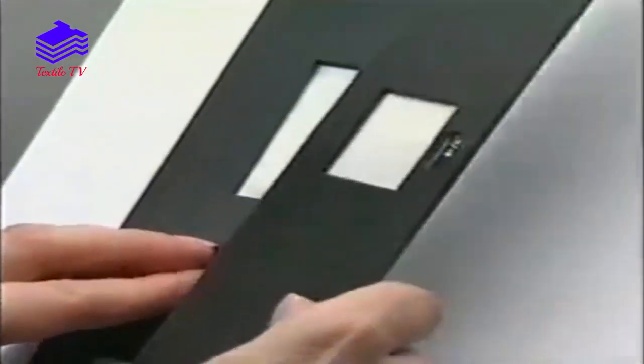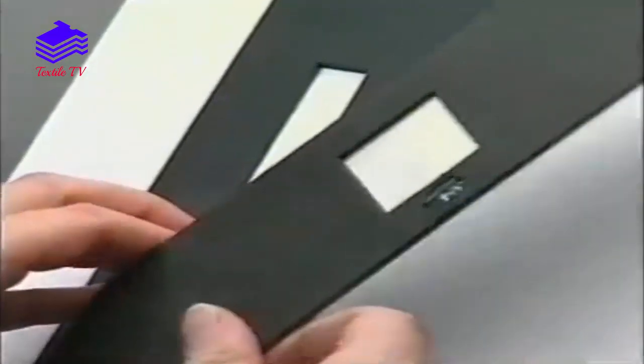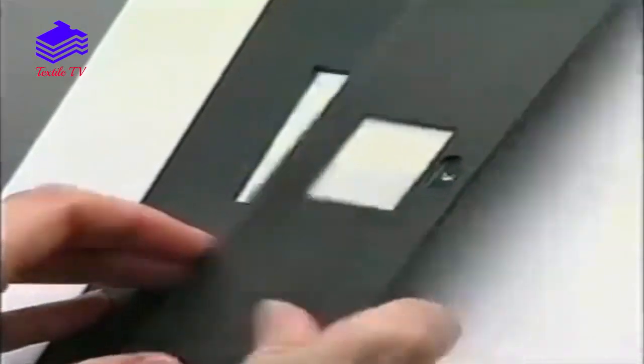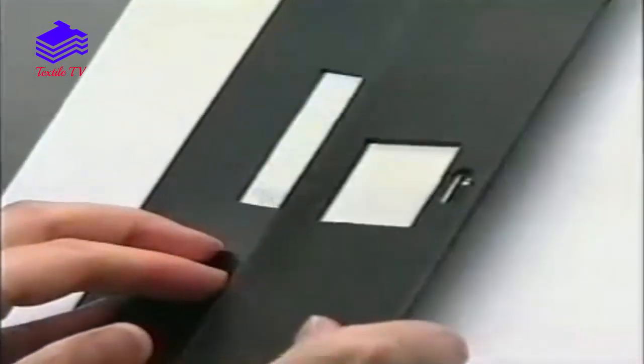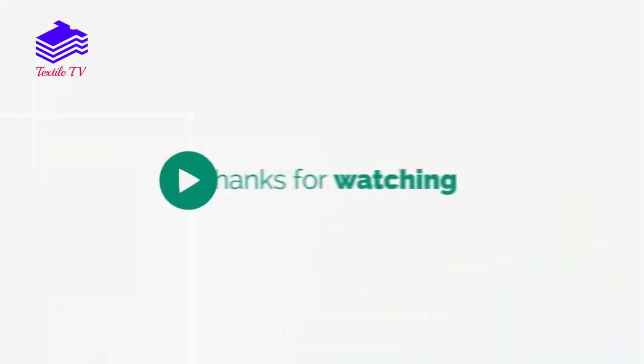The degree of staining is assessed under prescribed lighting conditions and graded against a set of standard colourfastness to staining greyscales, using a rating from 1 to 5.